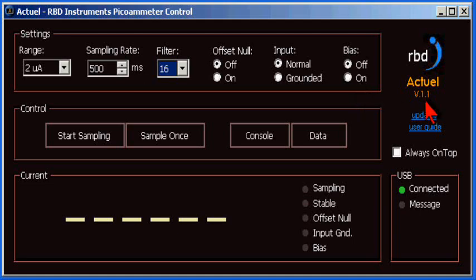On the right side, we have the actual version number, a shortcut to RBD instrument software updates page, and a shortcut to the actual user guide, which is installed on your PC when you first load the actual program.